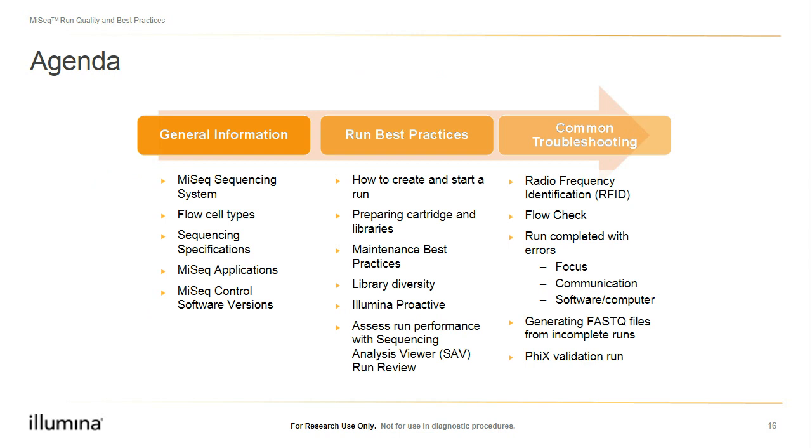So now that we've covered some general information about the MiSeq instrument, let's move on to run best practices, where we're going to cover how to create and start a run, preparing a reagent cartridge and libraries, and maintenance best practices. We're going to briefly touch on library diversity. We also want to discuss the Illumina Proactive service, as well as cover some basics of Sequencing Analysis Viewer to assess run performance.